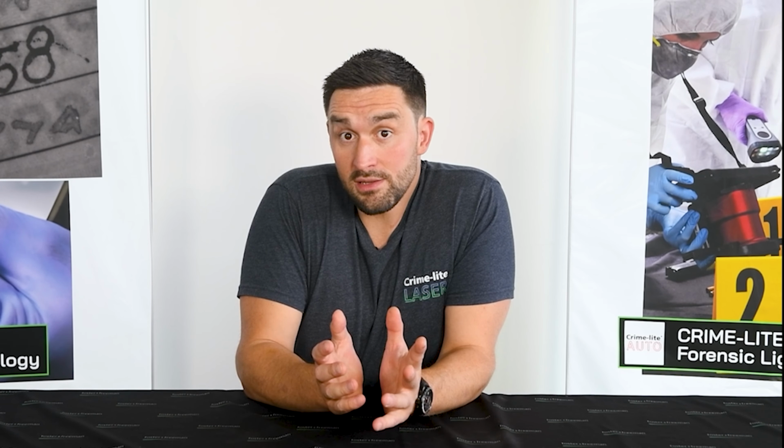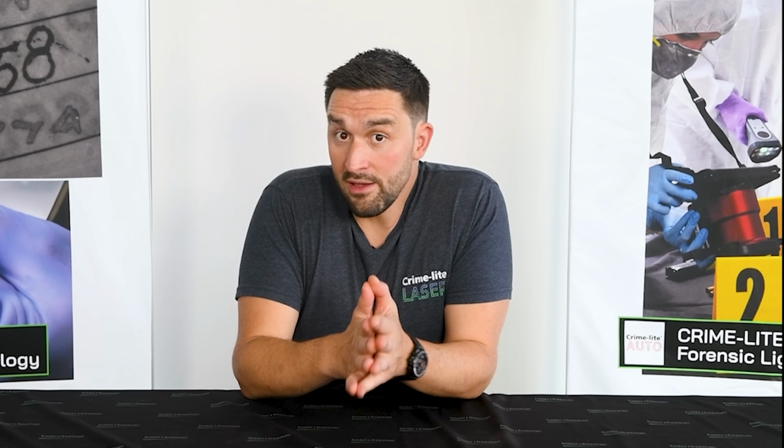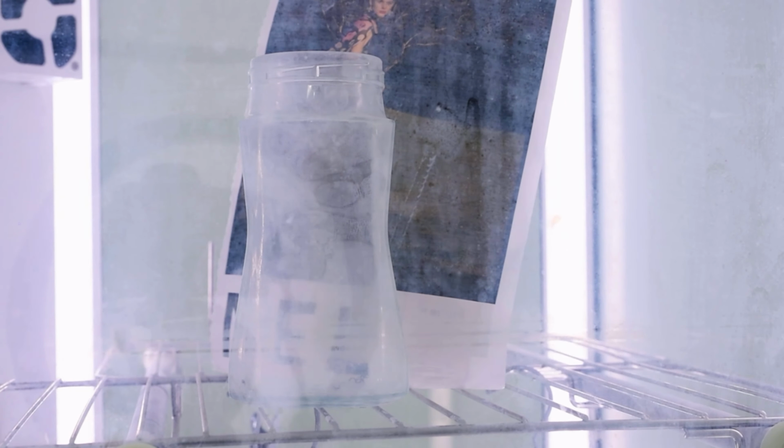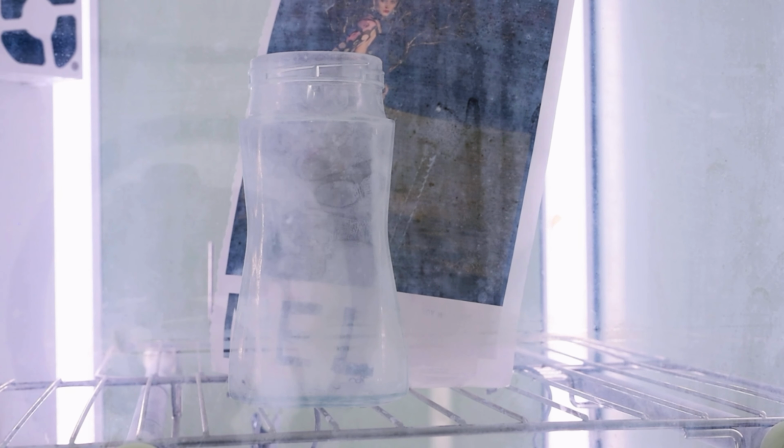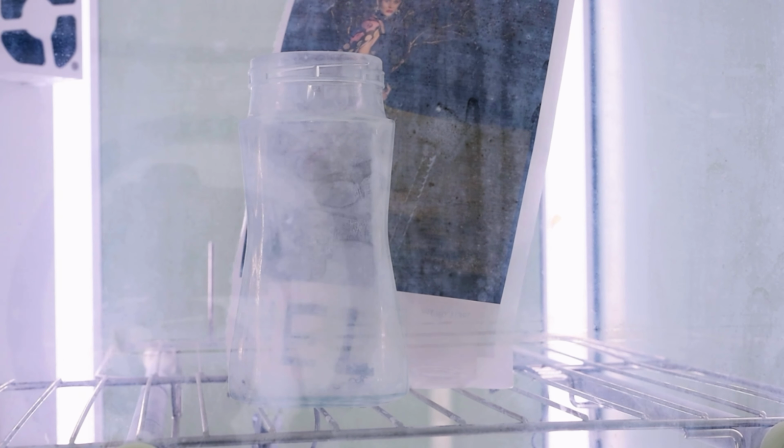In slight contrast, reagents like cyanoacrylate, which is deployed as a fuming process, interact with the salts that are present within the latent finger mark residue. This interaction leads to the creation of a polymerized material that forms a white, visible print, which is surprisingly robust and may be handled without too much precaution.